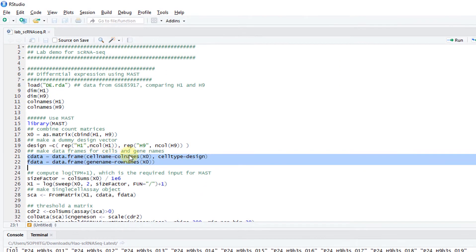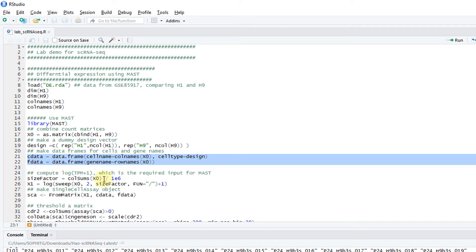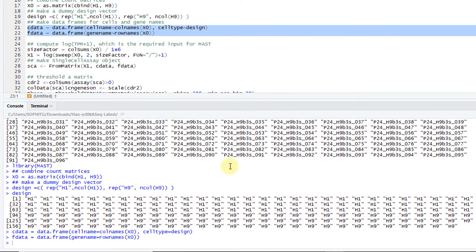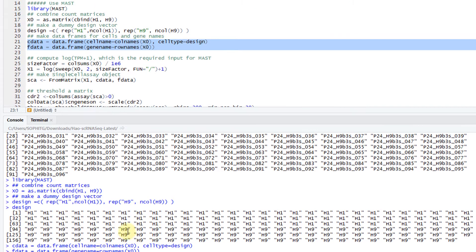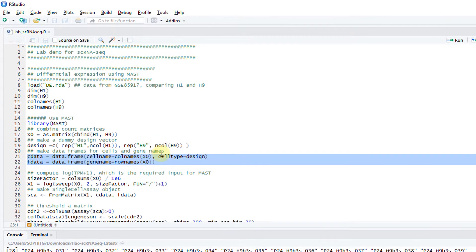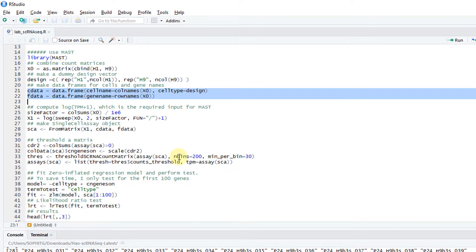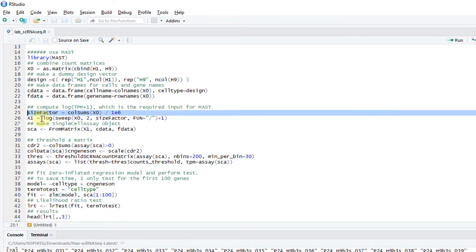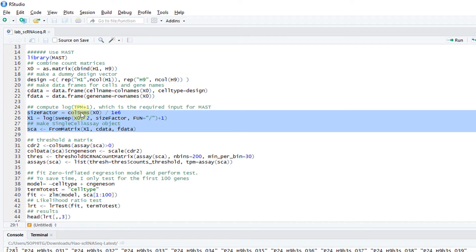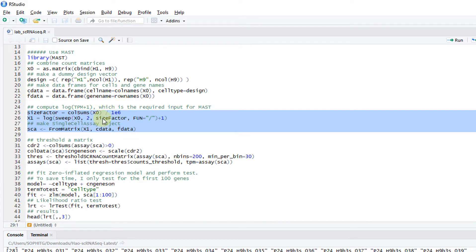Then I make the data frames for the cells and the gene names. The C data and F data are used in creating some object later on required for MAST. I just create two data frames. Now I need to compute the size factor. Basically for this column, I just take the column sums and create a size factor from there.